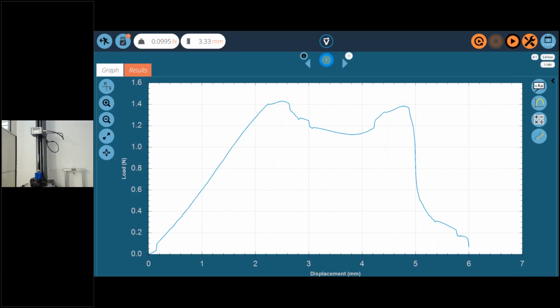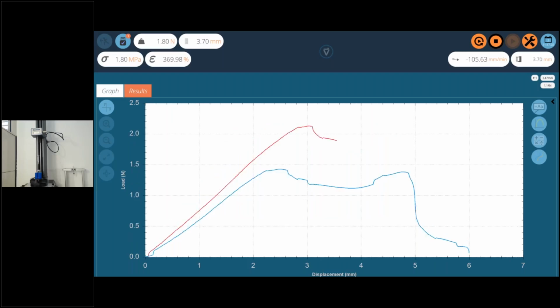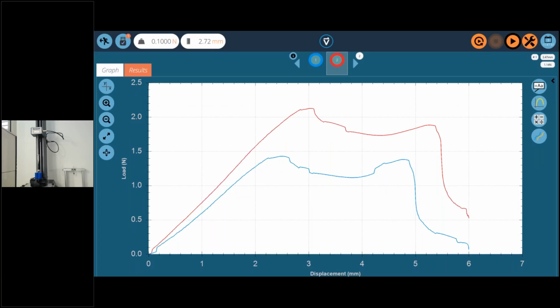We're going to run test number 2. Once again, I apologize, but in an ideal testing environment, what you do want to do is test different needles. For purposes of time, I see we're getting close to the hour mark here, so I'm using the same one as a proof of concept. So that's test number 2. So these are the 2 tests so far.